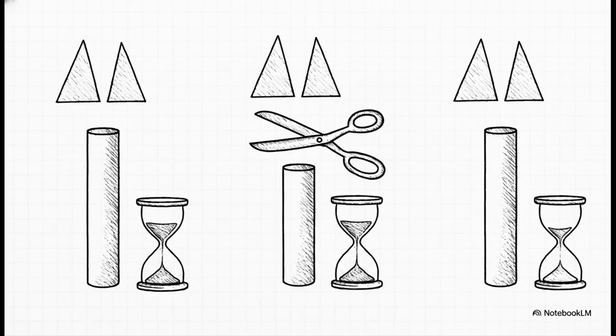But there are some clever workarounds. Let's say you're in a situation where your resolution is already fantastic. Well, you can actually still optimize, but this time you do it to save yourself some precious time. You can just swap in a shorter column. This works because, mathematically speaking, resolution varies with the square root of the column length, so it's a neat little shortcut to claw back some speed without completely ruining your data.